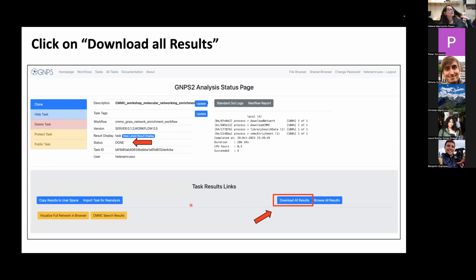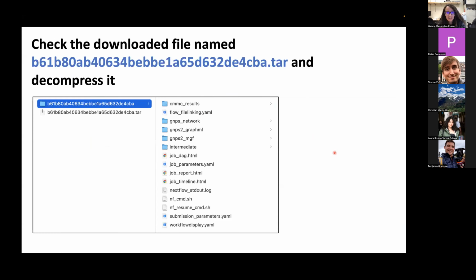Tar file is incompatible with Mac. No, it is. So okay, I'm going to move on, because right here I'm showing how, in this case, I'm using a Mac as well. So basically you can decompress this tar file and you're going to have a folder with all the files that are inside of it. So it shouldn't be a problem if you have Mac.